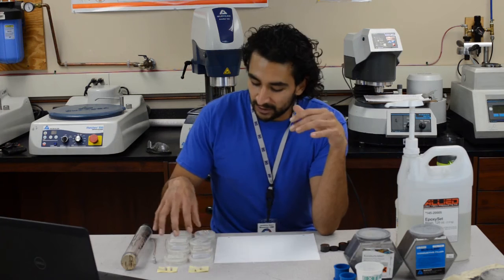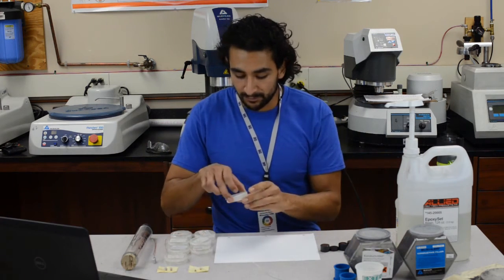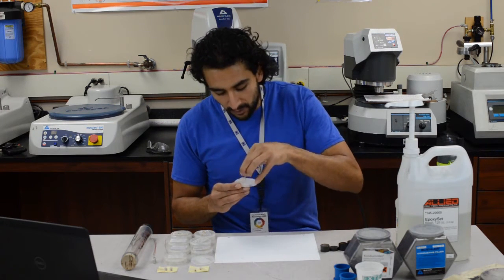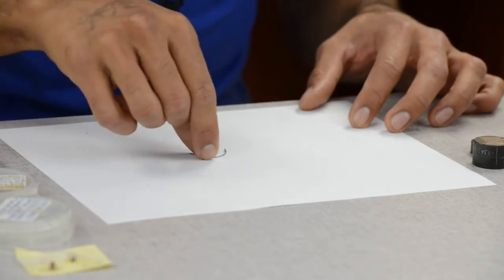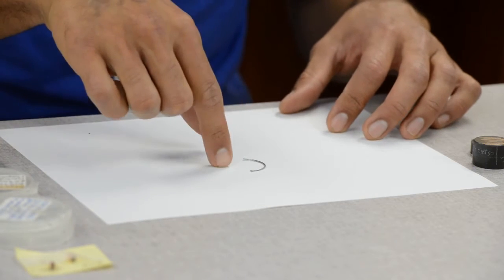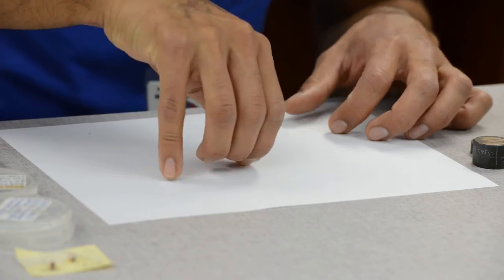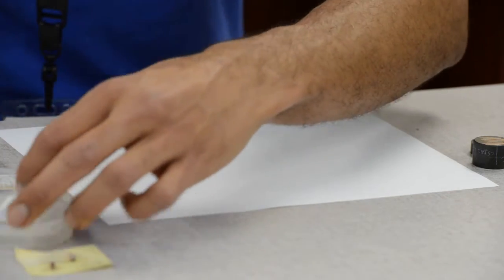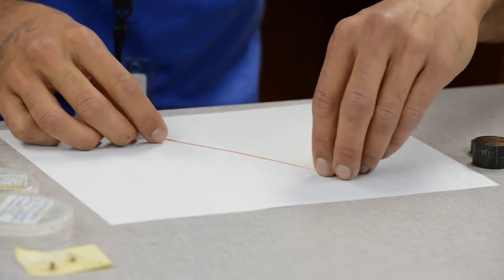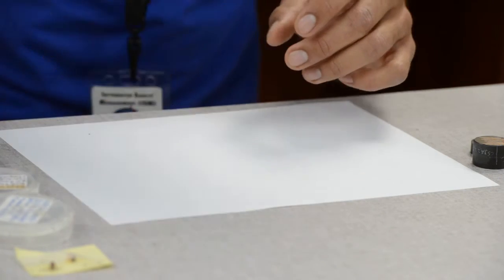I'm not going to go into much detail about what these samples are, but what we have here is four types of samples. First, we have these wires in a circular shape, and I actually want them in a longitudinal orientation, so they'll be laying flat inside the thermoset polymer puck. Then we have these straight samples, and I actually want them in a transverse cross-section, so they'll be standing upright inside the metallographic puck.